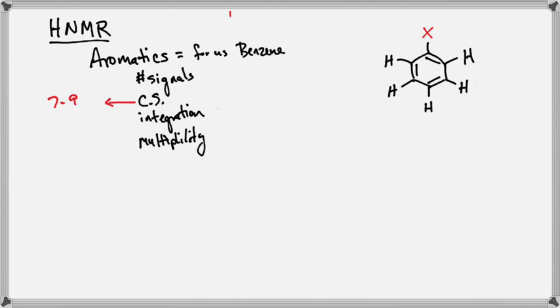The people saying 1 are saying all of these hydrogens are identical to each other. Does that make sense? They are different distances from that X. I can differentiate those, so that's not going to work out. For the people saying 2, you probably did something similar, except you recognized some symmetry and you said those 2 would be my guess.